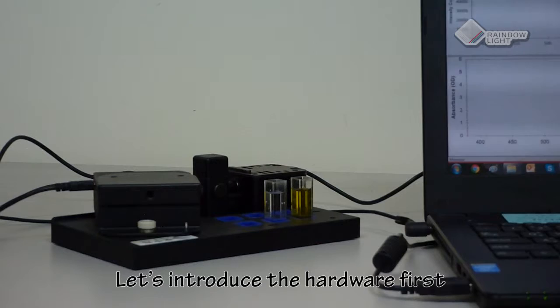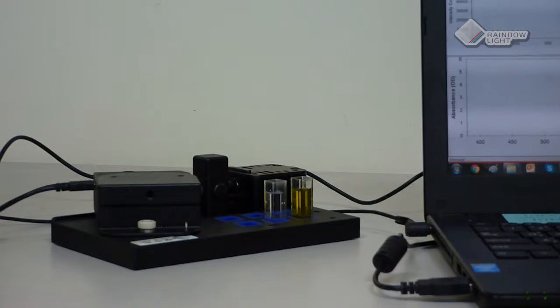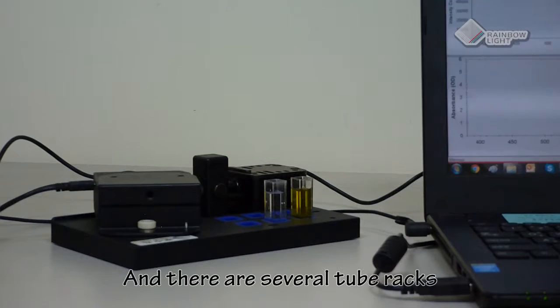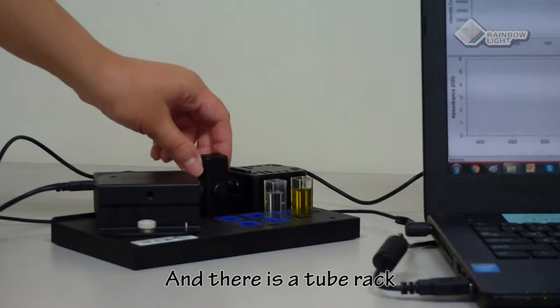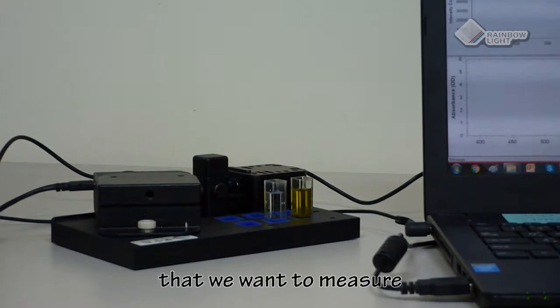Let's introduce the hardware first. This is the light source, which is a halogen lamp inside. And this is our spectrometer, which can measure the spectrum. And there are several tube racks for putting different tubes. And there is a tube rack that's only for putting the object sample that we want to measure.